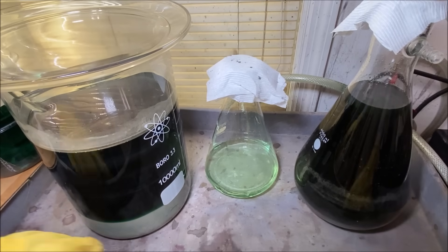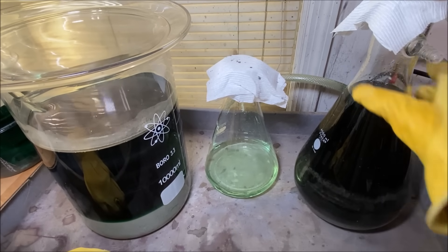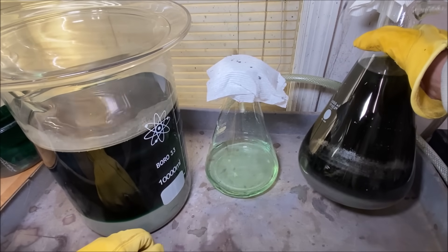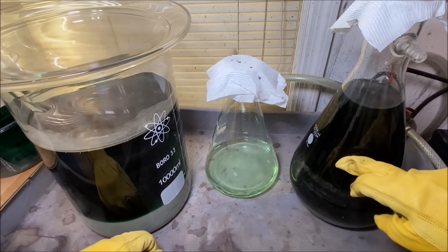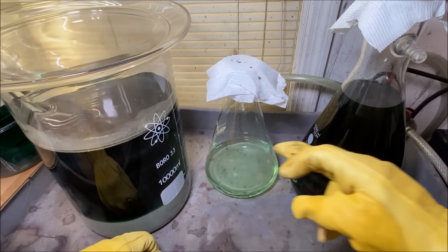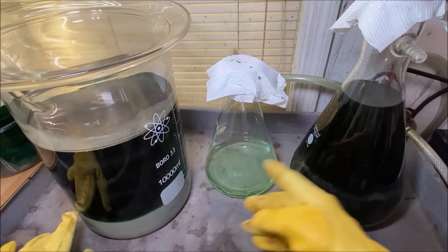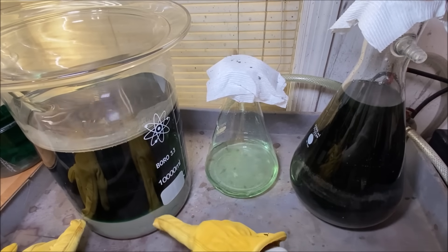Before I can filter those solutions out of beakers one and four into this flask, I've got to filter the solids out of this flask and recover the silver-bearing solution that's in here. It's going to be full of silver. Once I filter this junk out of here, I'll add some clean copper to it like I did in this beaker, and we'll render the silver out of this solution.